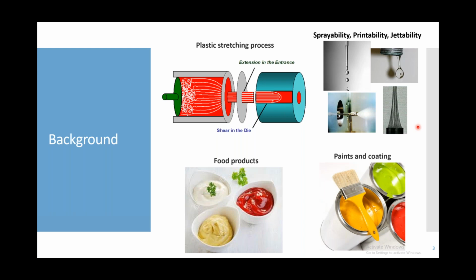Polymers are among the most common materials used in industrial complex fluids and so contribute to the flow resistance in many extensional deformations that influence manufacturing processes such as inkjet printing, filament spinning, porous media flow, and enhanced oil recovery. Another situation where extensional viscosity is important is in food industry. For example, the viscosity of tomato ketchup is a major quality component for consumer acceptance. So it is necessary to control and adjust the processing parameters continuously to achieve a desirable and constant quality in the final product. So it is important to characterize the ketchup extensional viscosity together with the shear viscosity to have a complete description of product flow behavior.